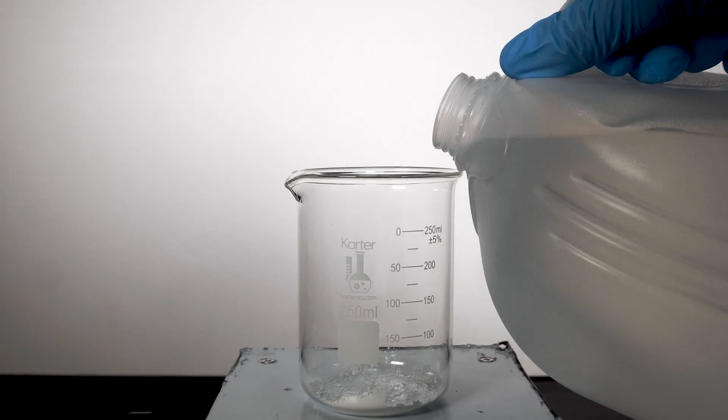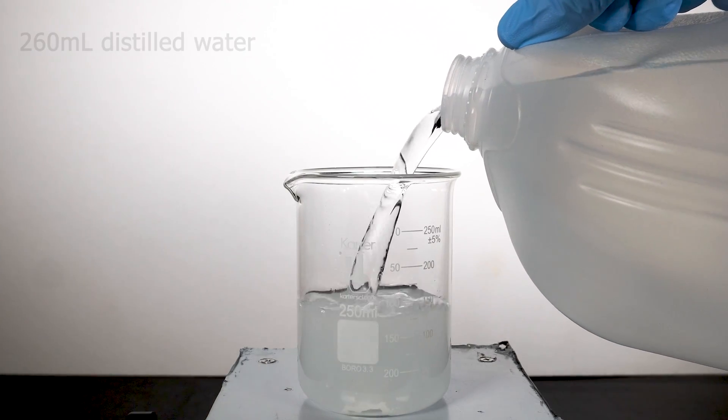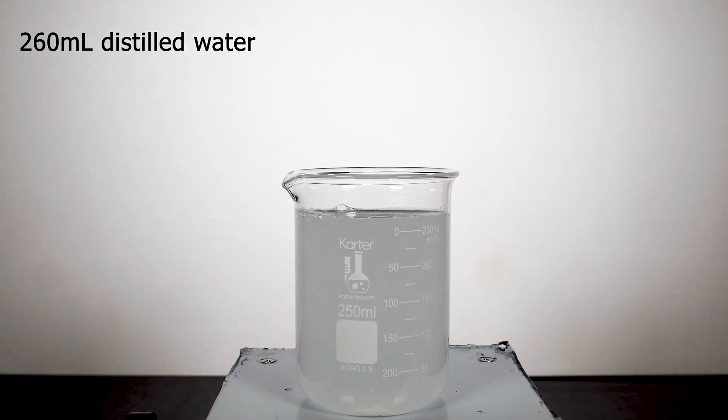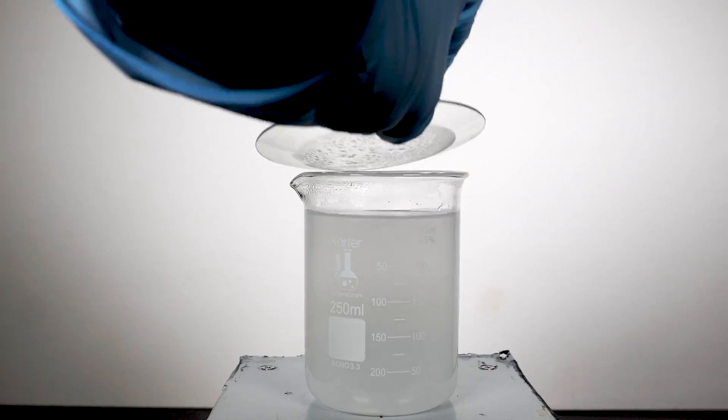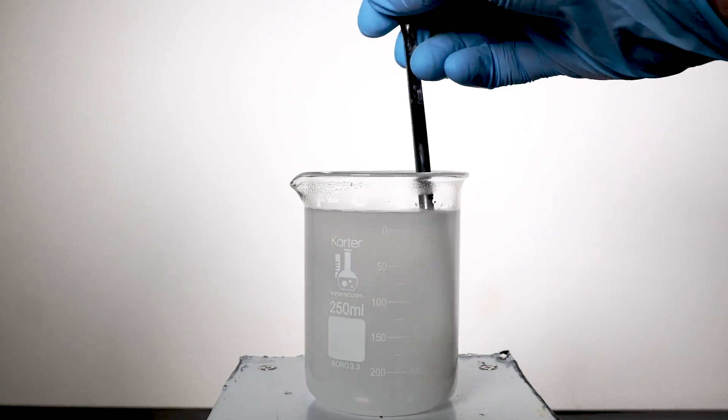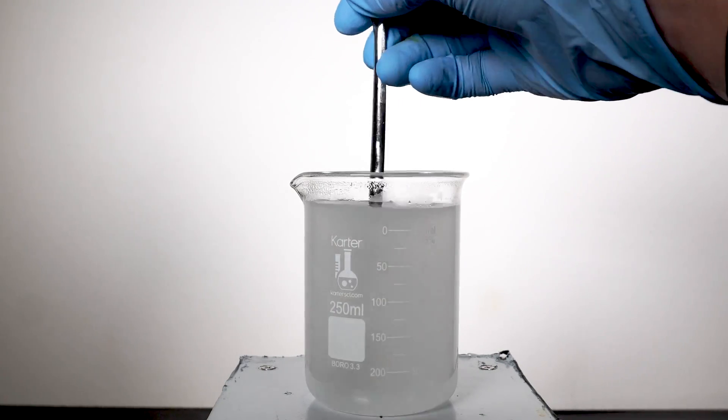After this, we need to dissolve most of the cornstarch in water, so I add about 260ml of water to the beaker. The real problem is that cornstarch is not really soluble in water, and to make most of it dissolve, we have to heat it up. This is where a microwave really comes in handy, and after about a minute and 30 seconds, almost all of the cornstarch is ready to dissolve.